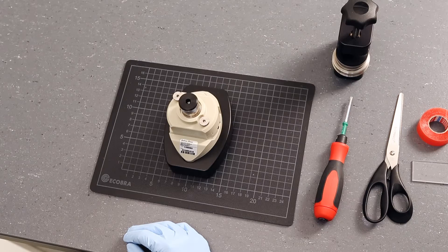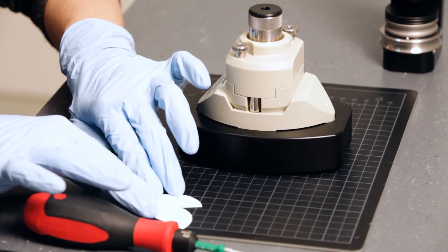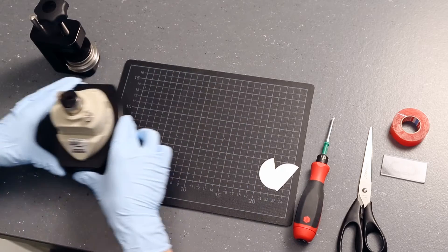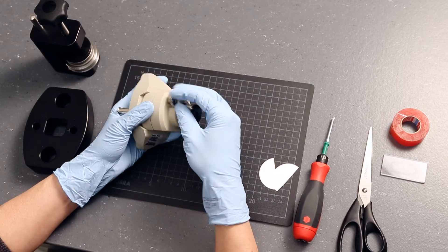We are going to mount a flat polymer membrane. First, you need to disassemble the cell. Remove the two screws to open the measuring cell.